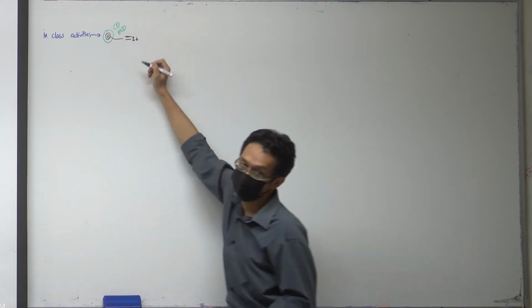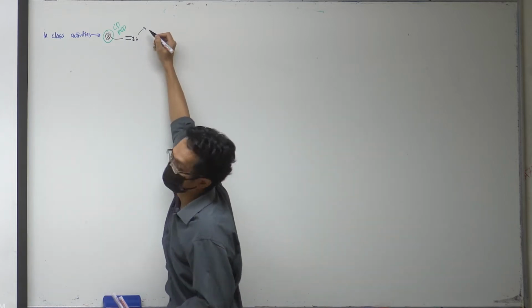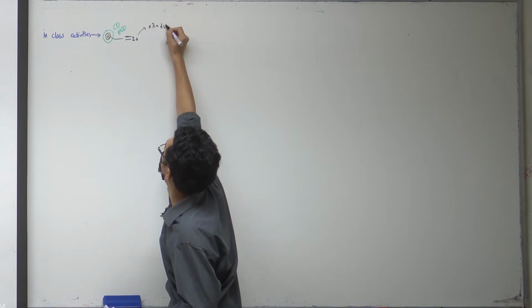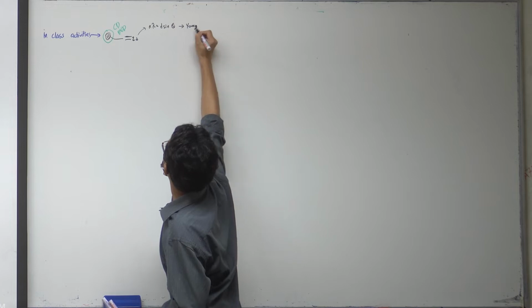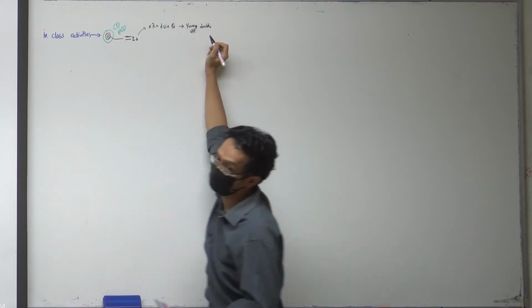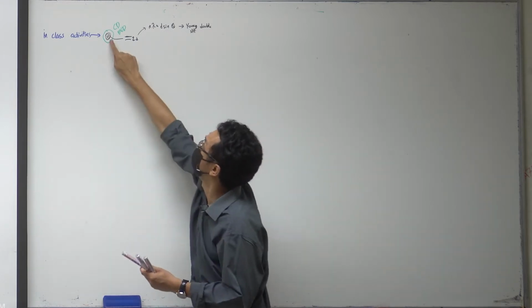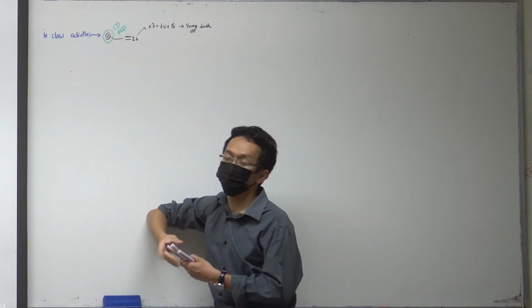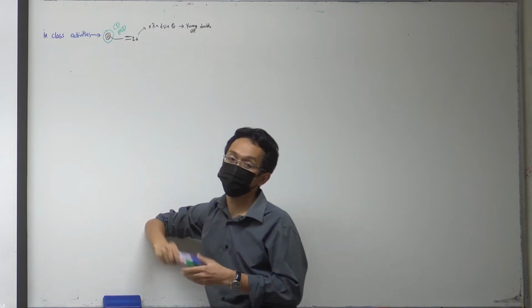Let's say we call it D, and then you shine the laser onto that, and you use the equation. What is the equation? n lambda equals d sin theta. This equation is also called the Young double slit equation. So you use this equation to find the distance between each groove in the CD. You cannot see the grooves by themselves. Even with a normal microscope, it's very hard to see.